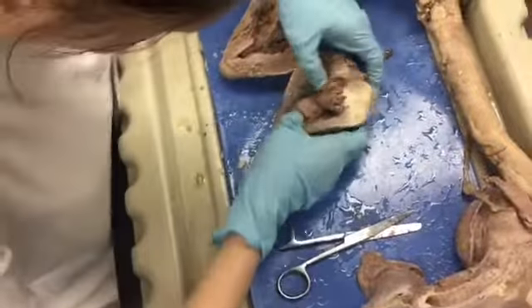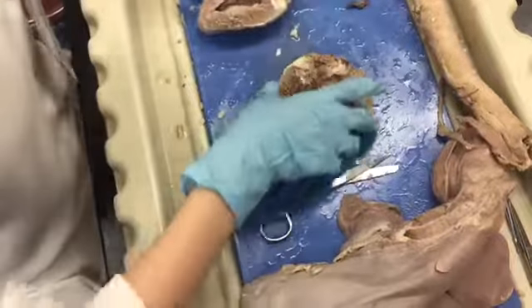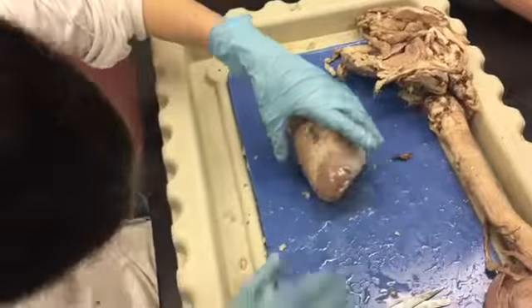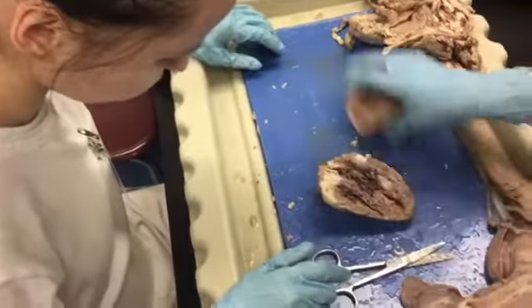There we go. Good view. See? Inside of the heart. Alright, do you know which is the left one? Goes like this. The first side. Like this. Okay. Just like this. Can you guys tell me which is the left and which is the right? I can, just by looking at it.